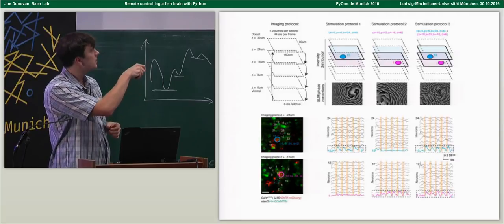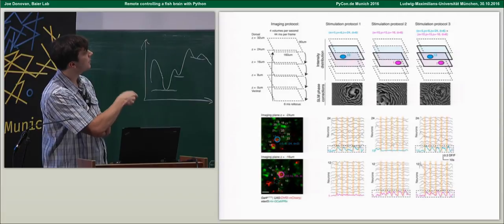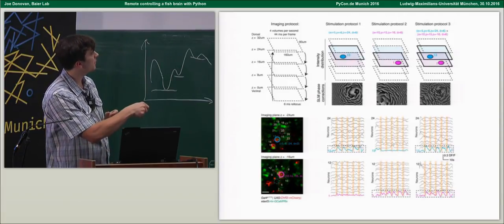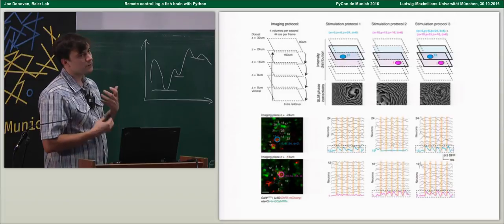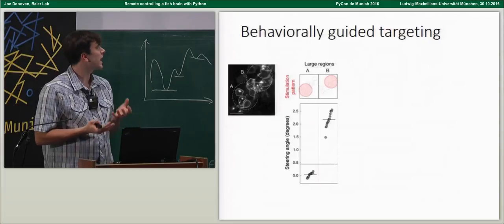So we can select both, and you can see that the pattern looks like some weird mixture of the other patterns together, and we can activate these 2 neurons very precisely without affecting the rest of the circuit so much. But actually we want to affect the rest of the circuit, and we want to go in, stimulate multiple neurons, and figure out how the brain actually works.